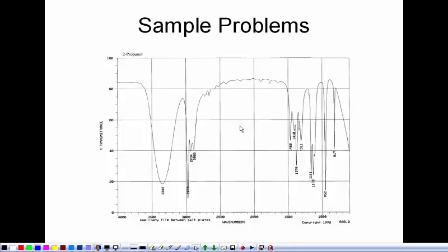So what you have for homework then is a series of spectra and a series of compounds. What you're going to do is match the spectrum to the compound. You're just going to hand in the front page, and you're going to write the spectrum number next to the compound. There's one for each. If you see OHs, then there's going to be an OH that has an alkane attached to it. There's going to be an OH that may have an aromatic ring or a double bond to it. So what you want to do is just go through the spectrum and mark down what's there, and then try and match up the spectra that way.